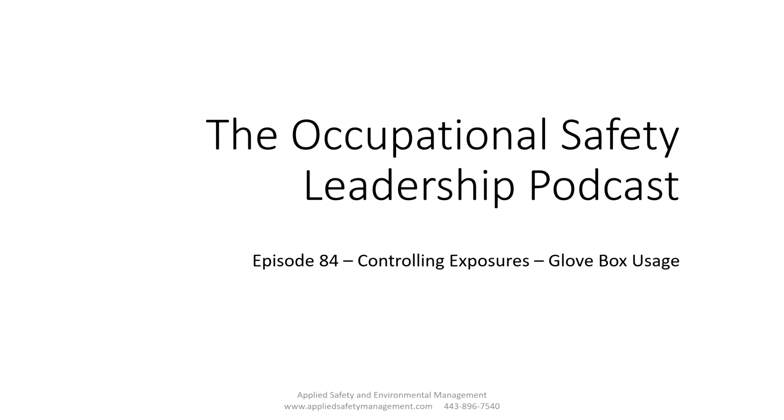That is it for episode number 84. We talked about controlling exposures with the glove box. These are special ways to help control the atmosphere. They also come with a whole series of different filters and different things. It depends on what that application is. You certainly can't look at a catalog and say, I'm going to buy the cheapest thing because a glove box is a glove box. You have to understand your application, and then you have to buy it for that application.